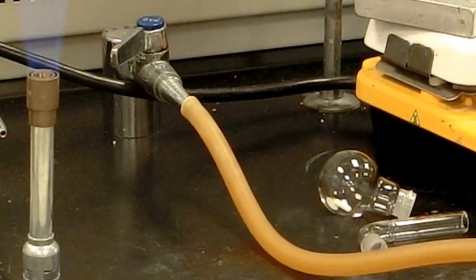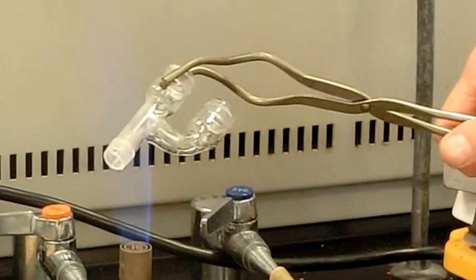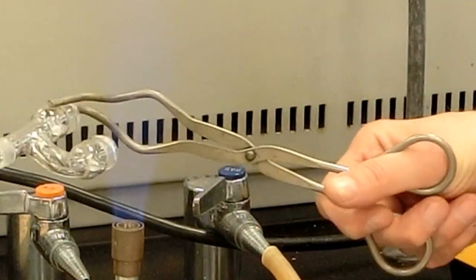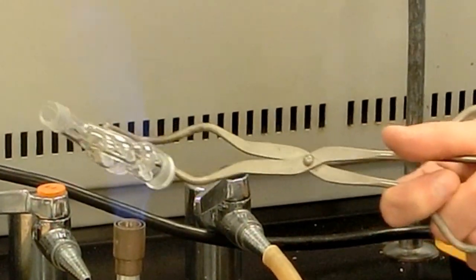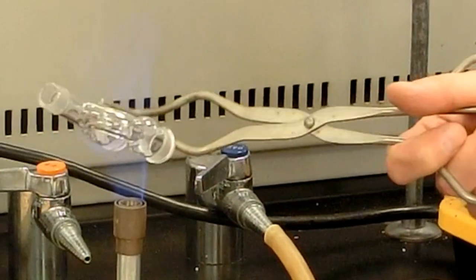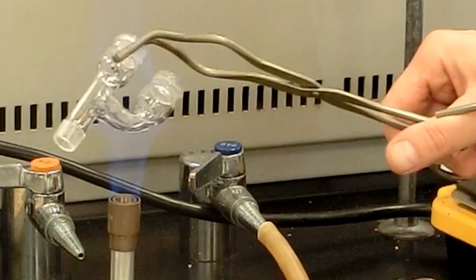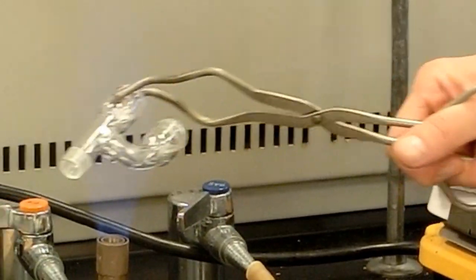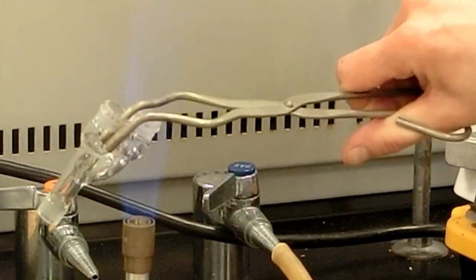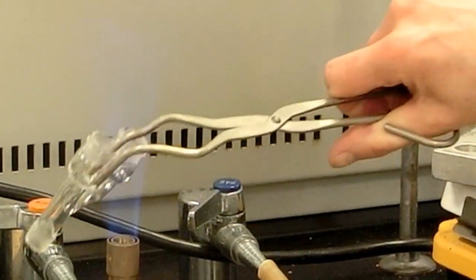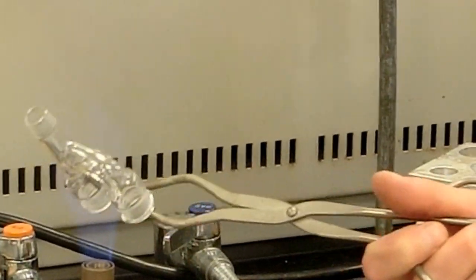And now the Claisen condenser. Torch this really well. And everything, at this point, when you flame dry, of course, you do not want your ether solvent anywhere near the flame. The ether fumes can travel quite a distance and ignite, and so when we have the flame out, we want the ether sealed up and put away. It's probably the biggest safety concern in this lab.